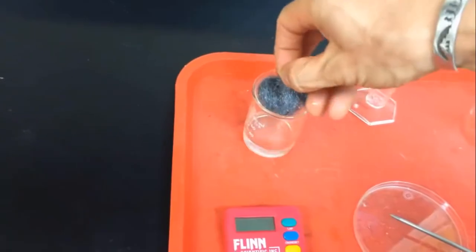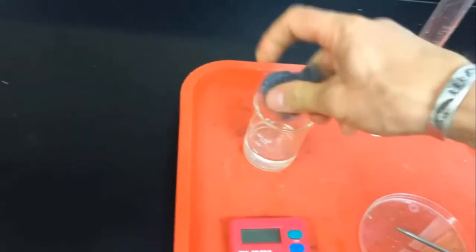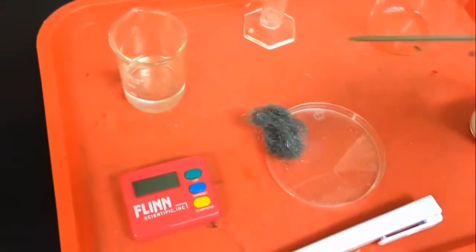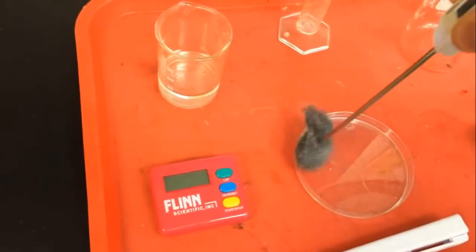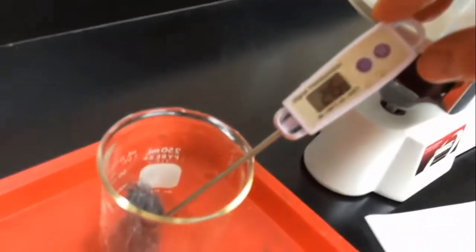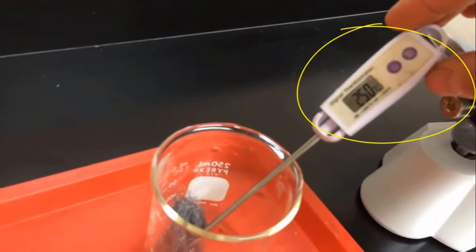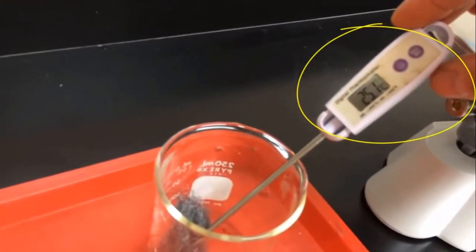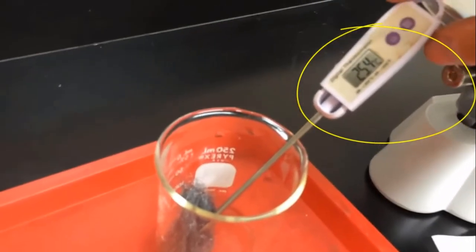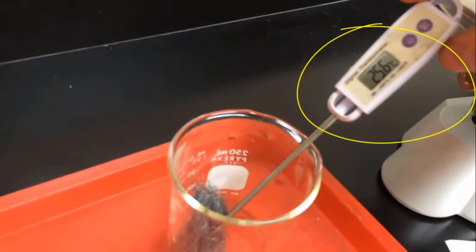Here it's with vinegar, guys. Now look at the temperature after the reaction. Wait. Look how the temperature has been increased, which means exothermic or endothermic? You have to tell. When the temperature after the reaction increases, what is it? When it decreases, what is it?